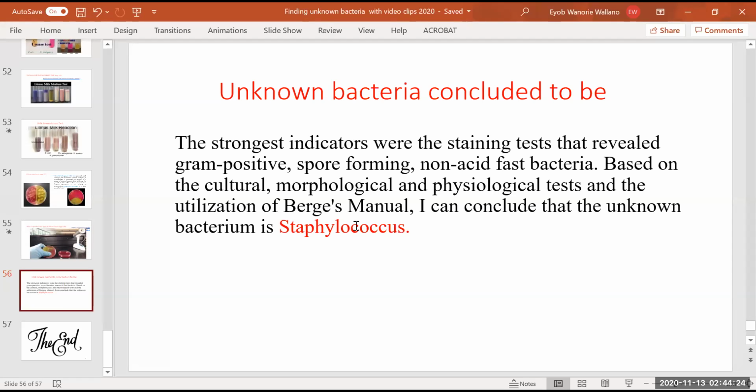So for this reason, you don't need to take somebody's culture. You need to work with your own culture. But in this case, because of the MSA agar and the catalase test, the student has a Staphylococcus. Now, the student is going to conclude. For example, Dr. Asi wants about a two-page explanation. I don't need it. I want only the short answer and then finish the activity. Five pages, what they have done, plus they need to give me the conclusion, this answer.